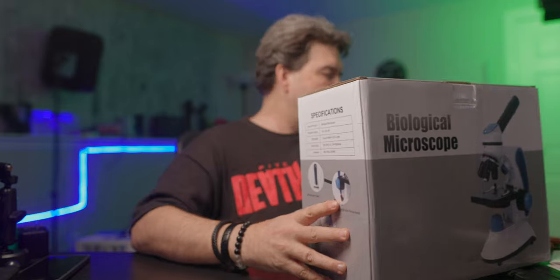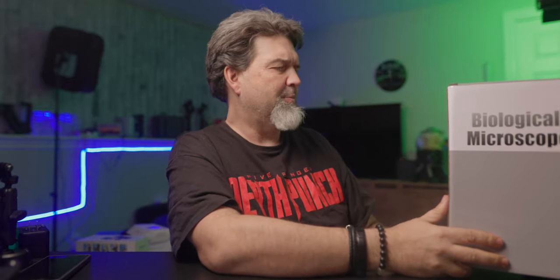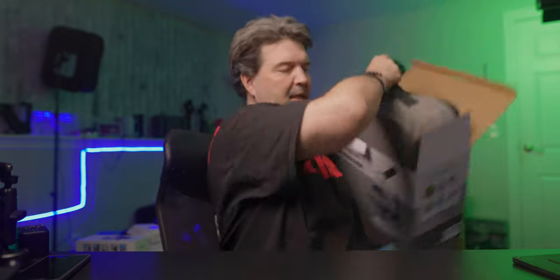Biological microscope. Again, the description - I'll have a link to it. On the box it doesn't really say much. I guess maybe it's from these guys - Focos, I don't know. That's the only kind of label on it. I'm gonna put it this way: name of product is biological microscope. I like that it comes in a case and it's not crazy heavy.